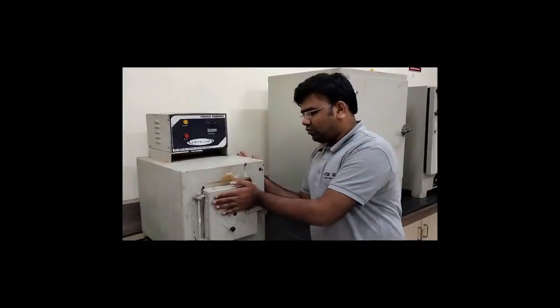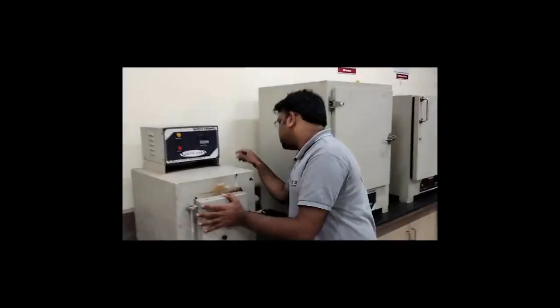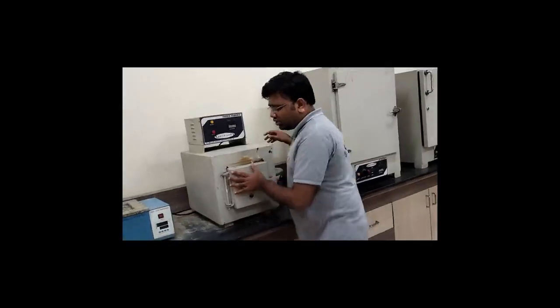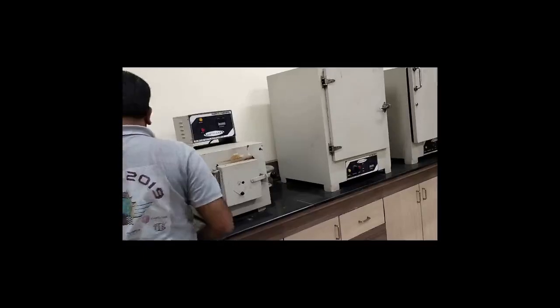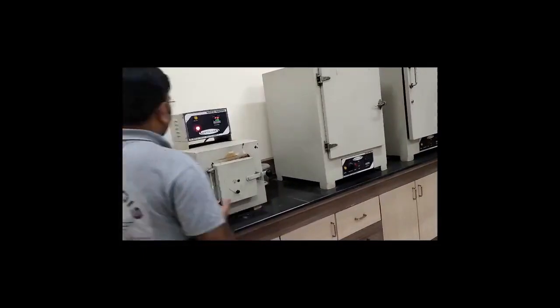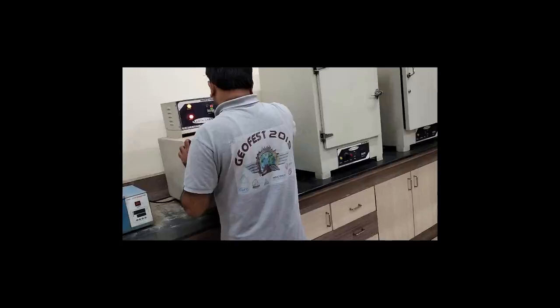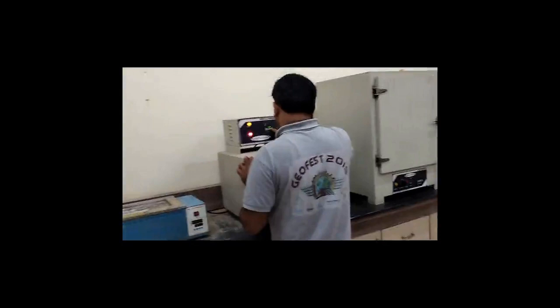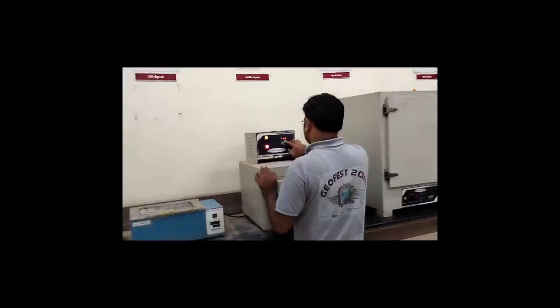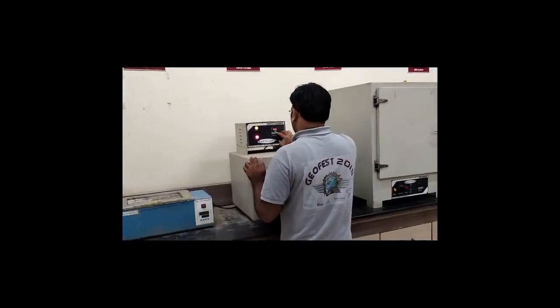So when we have kept the crucibles, now we are going to start this muffle furnace. For starting the muffle furnace, I will just switch it on. We have to keep our crucibles in this muffle furnace. I'll be setting the temperature first. It is in the range of 550 to 600, so we are going to keep our temperature at 550 only.